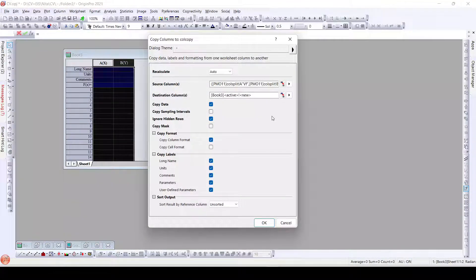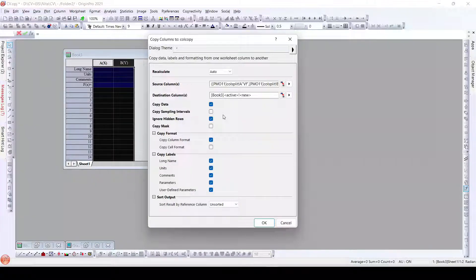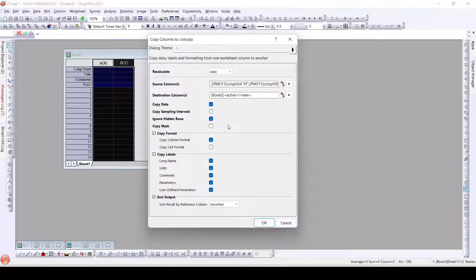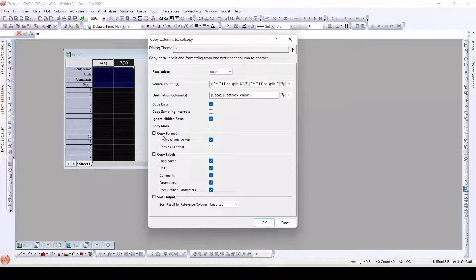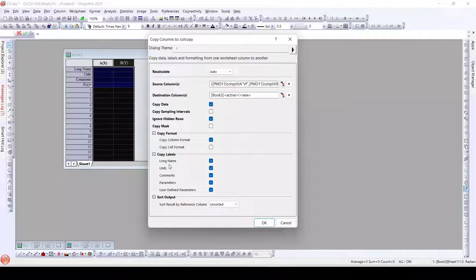So the destination columns have been selected. Copy Data — data will be copied. Copy Sampling Intervals — if we have some sampling intervals in the data we can copy them. Even hidden rows can be ignored. And Copy Mask — if we have added some mask to that particular data, even that can be added by selecting this tick. Further, what we have is Copy Format — all the column formats can be copied. Copy Cell Format — if we have any cell format we can copy that. Copy Labels — all the labels: long names, units, comments, parameters, and user-defined parameters can also be copied.